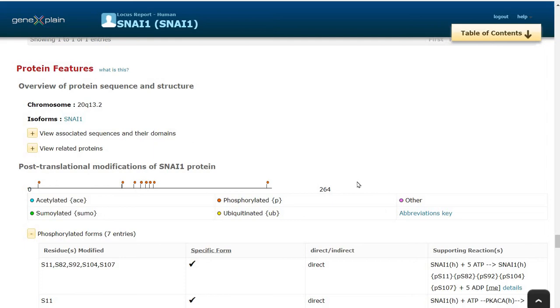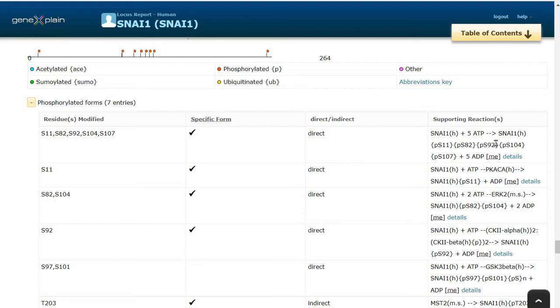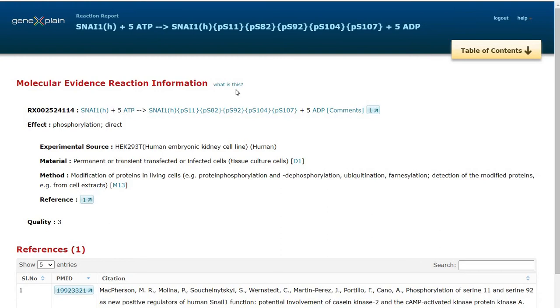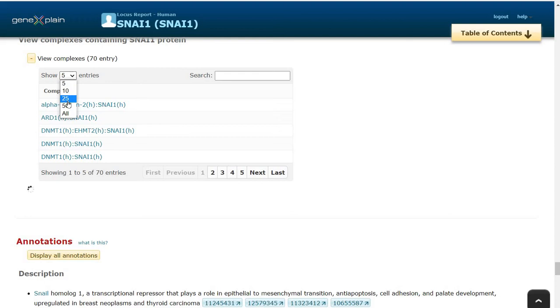It might be interesting to see the protein features for SNAI1 as a transcription factor. Several post-translational modifications of SNAI1 protein are known like phosphorylation. We see particular amino acid and its position that is phosphorylated in also the supporting reaction from where this information is curated with references provided. If we click on the details, we can see here the molecular evidence reaction about the phosphorylation of SNAI1 protein. We can also see several complexes of which SNAI1 is part of.